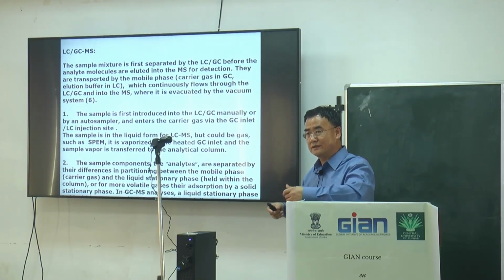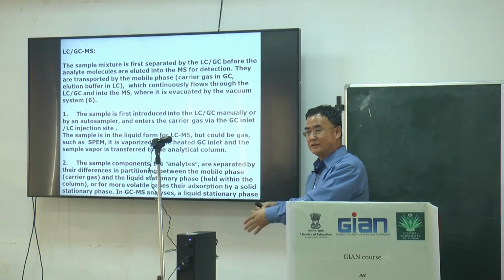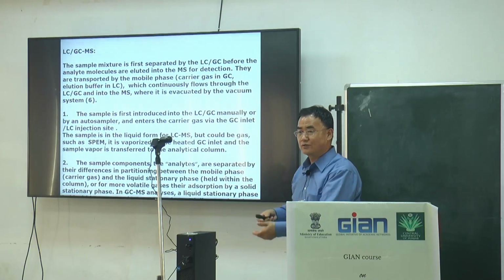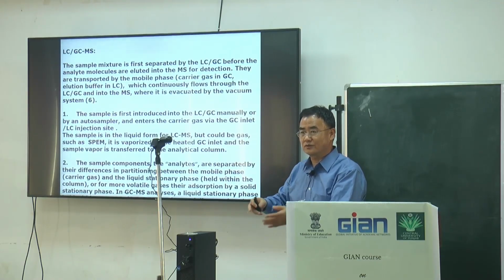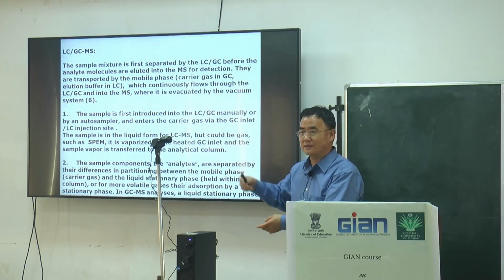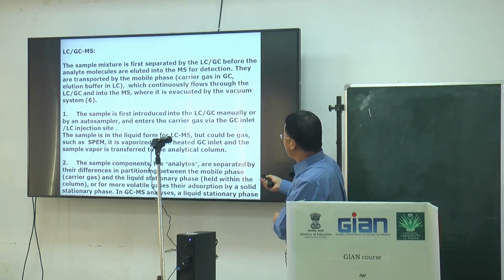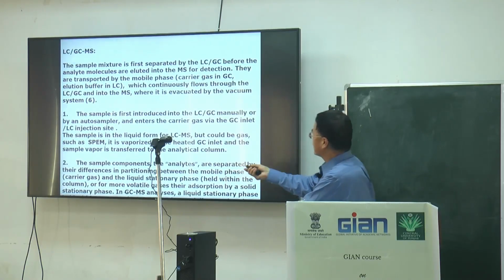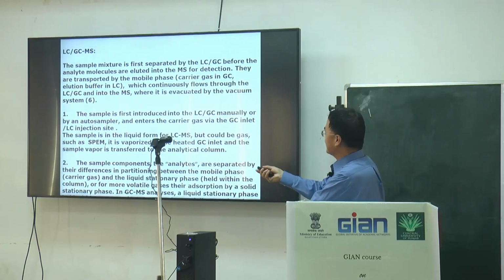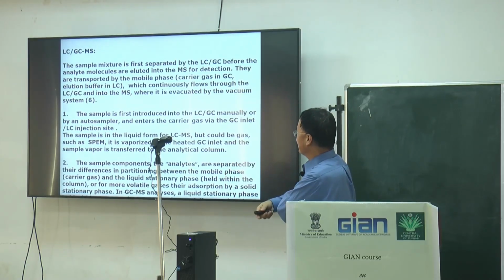With quick flash you prepare large amounts of sample for biochemical or other work, which is very important. Auto sampling really depends on the machine, but for analytical work, the machines we use have auto sampling.